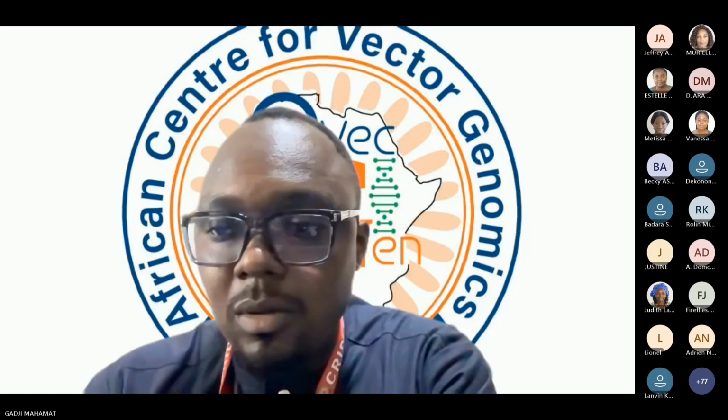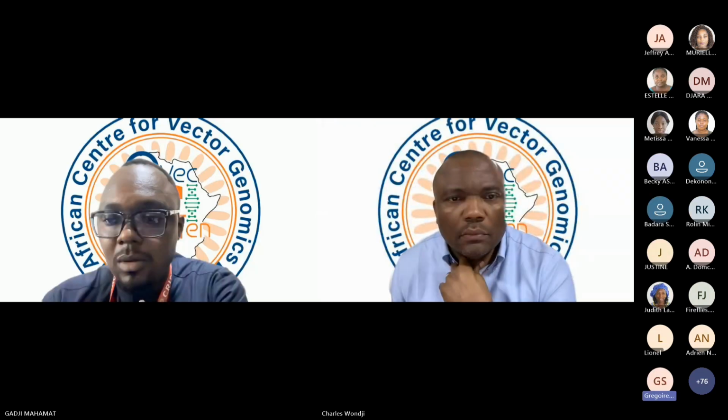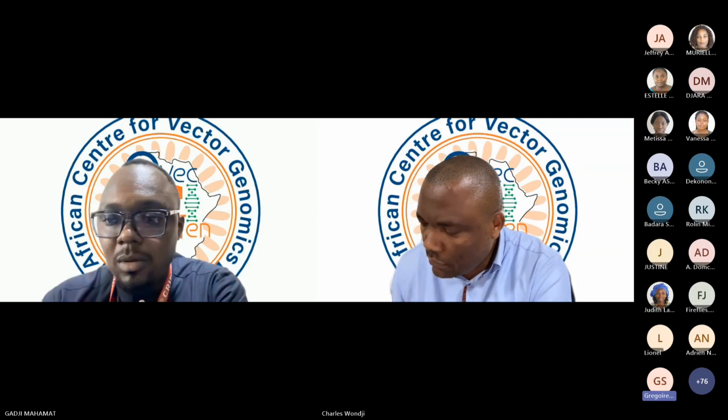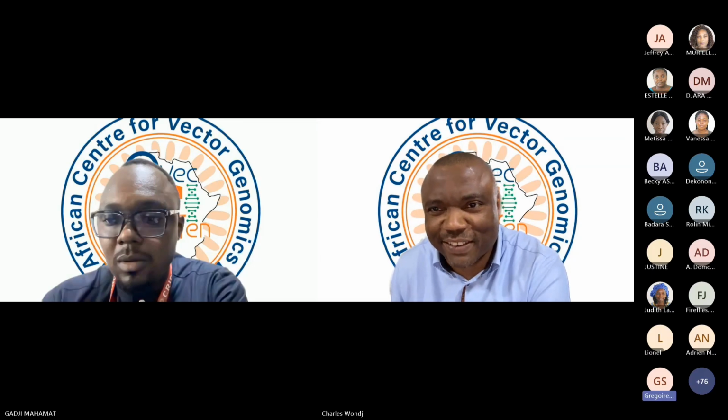Okay, morning, Professor. Morning, everyone. Thank you very much for this nice presentation. I'm Grégoire Saodogo. I'm from Burkina Faso. So I was asking, in Africa, sometimes even for the extraction, the different methods that we use, like the Qiagen kit or other reagents, it might be really difficult sometimes to get them on time and then prepare your samples and send them to CRID.